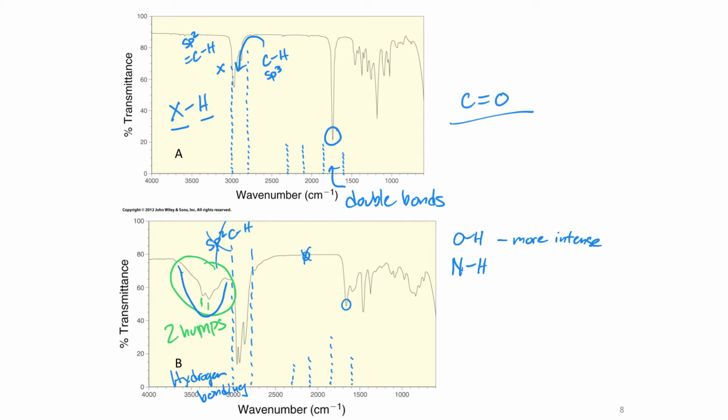This hump that I've drawn only stretches to about 50% of transmittance, and so I think we probably have NH bonds. And because there's two humps, that equals, we have an NH2 group. Each of the hydrogens can essentially stretch or bend in different ways, and that gets us two different intensities of two different wave numbers of absorbances, and that is what causes the two humps.